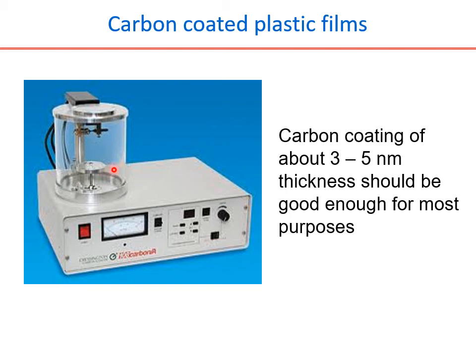The answer is yes. Then how do we overcome it? That is by temporarily suspending the hydrophobic nature of the carbon film, and that will be done by the glow discharger. So what is a glow discharger?